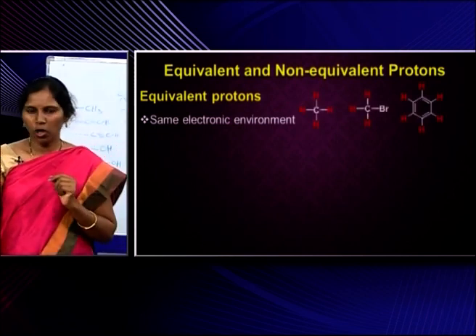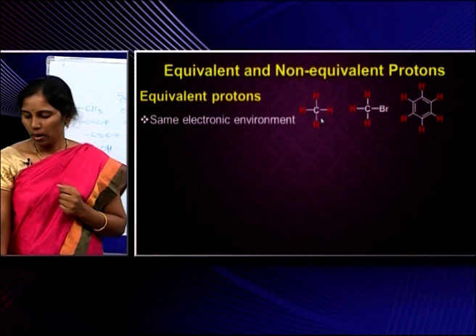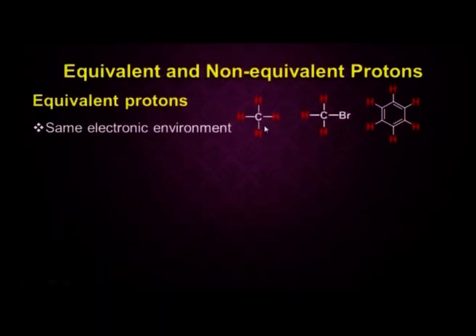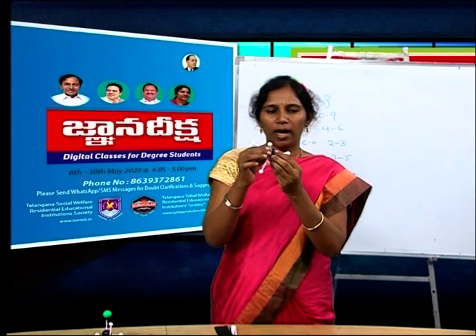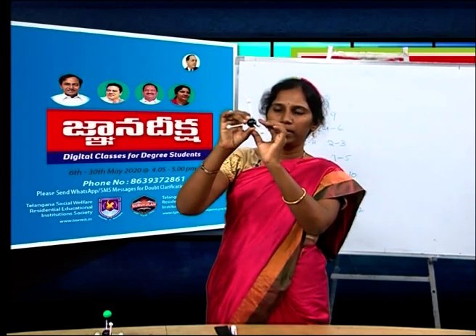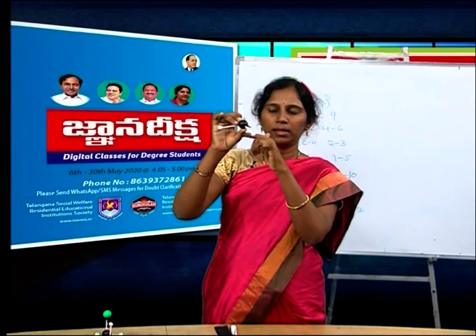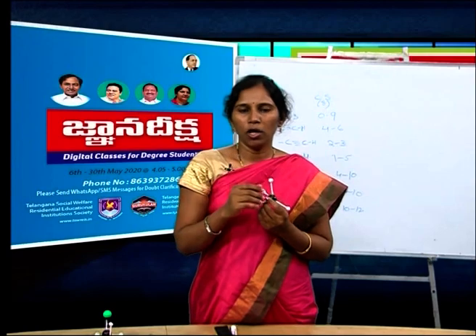See, the first molecule is methane. On the screen it is looking like a plus shape, no, but in reality the three-dimensional picture is this one. See, carbon and 4 atoms are equally present, equally oriented in space, and the 4 protons are said to be similar. See the second molecule on the screen.